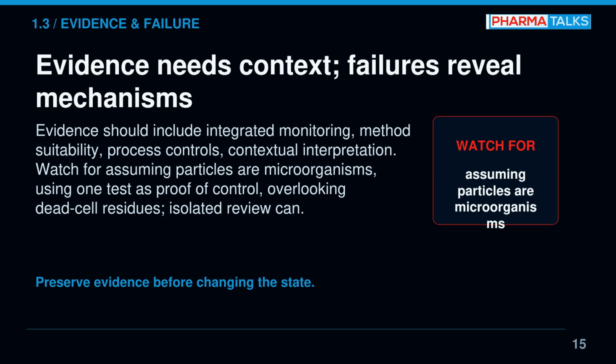A particle is not automatically a microorganism, and microorganisms are not reliably represented by particle counts alone. Likewise, a single test cannot demonstrate every dimension of contamination control. Combining viable data, particle trends, process events, environmental conditions, and behavioral observations provides a more defensible picture of the state of control. Cleanrooms as a system of controls.